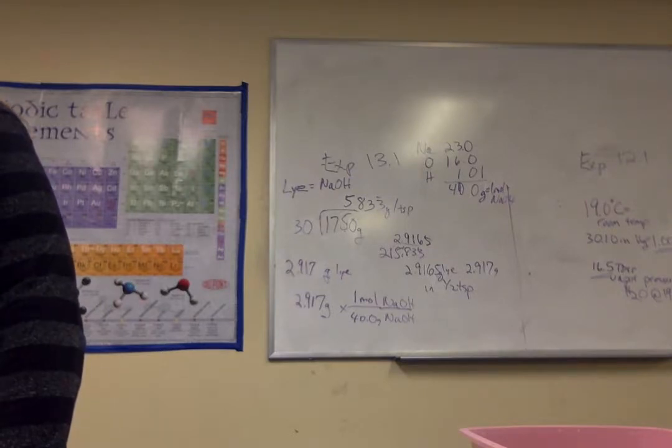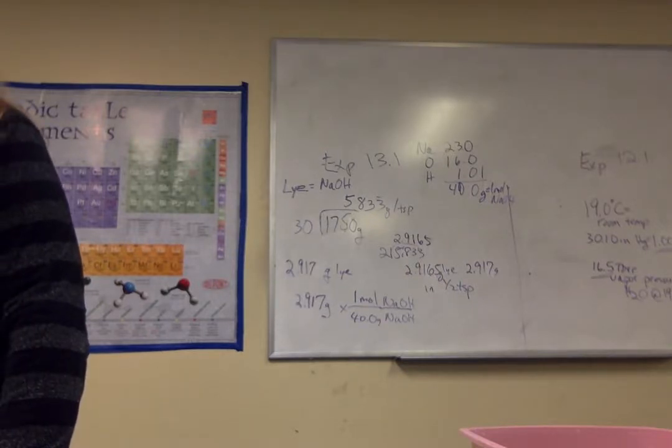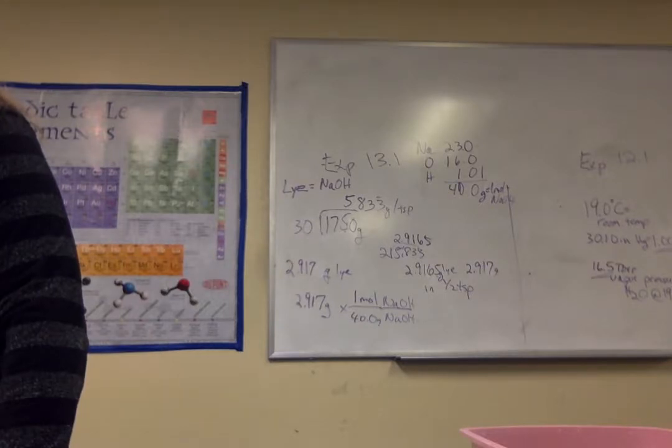Say that again, please. You're adding both of them together, because she decided it wasn't 26.9. You're doing the mass of the vinegar plus the mass of the lye together. Okay, well, the mass of vinegar we already know. 100 times 0.99 is going to be 99 grams.